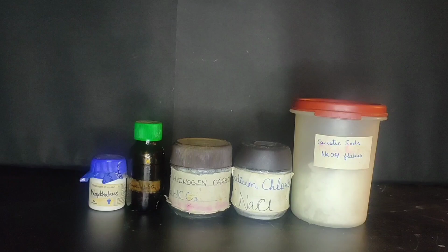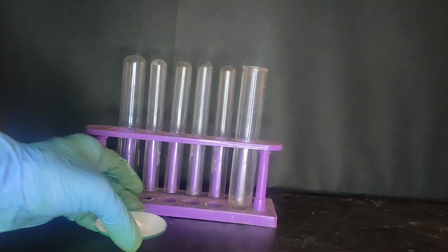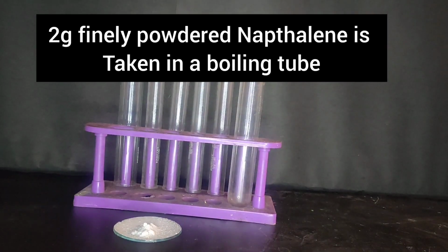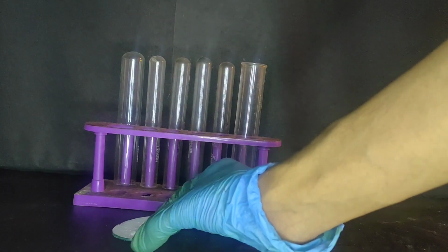So recently I attempted to make alpha naphthol, and these are the chemicals required. So we start things off by taking 2 grams of finely powdered naphthalene in a boiling tube.